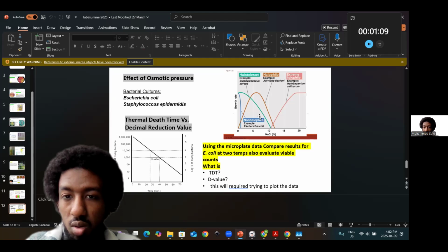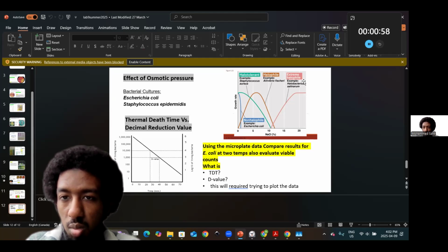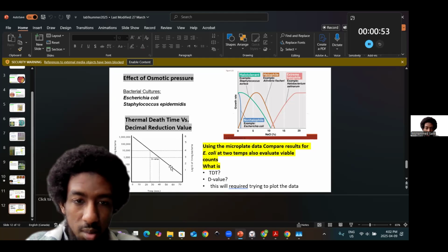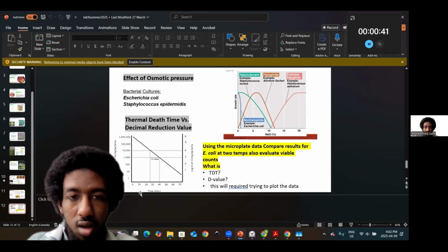And just to appreciate, you have non-halophiles as non-osmotolerant. We have also a diversity from halotolerant to halophiles, more like the halophiles to extreme halophiles that depict osmotolerance. And then I described as well the D value that can be shown here, even outside of the initial cell density post exposure of heat. So that way you could see essentially a tenfold decrease that depicts the D value.